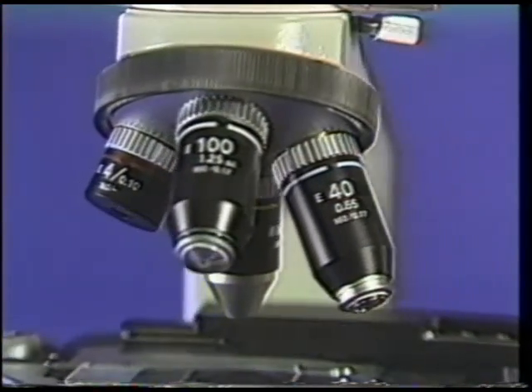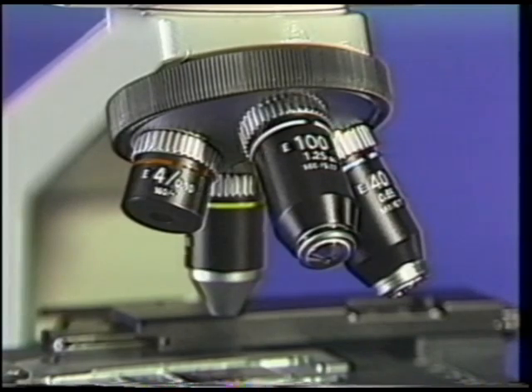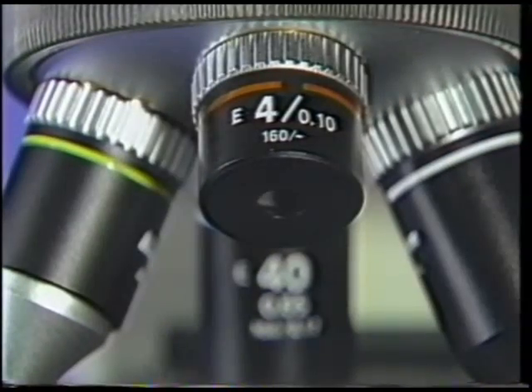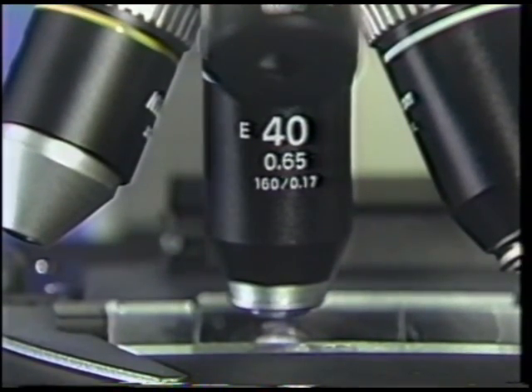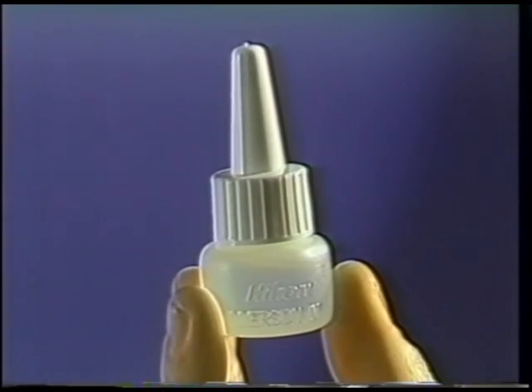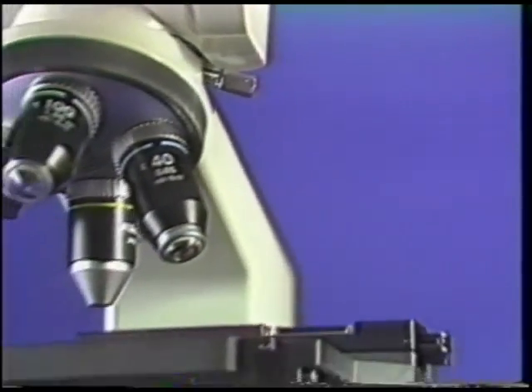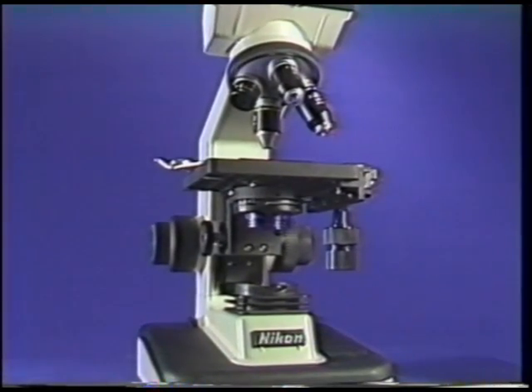Proper use of the oil immersion objective is necessary to ensure the best image, as well as prevent damage to the lens. Oil should never come into contact with any dry objective. Oil should never be placed on the specimen until the viewing area has been located with a lower power objective, such as the 40X. Use only the oil supplied with the microscope, as different oils may not provide the sharpest possible image.